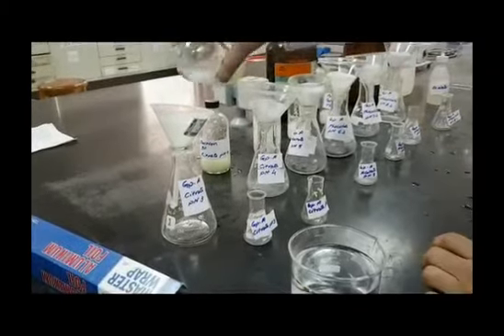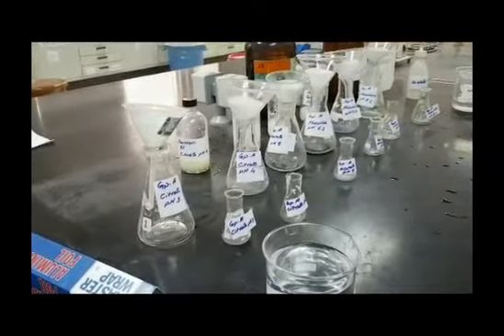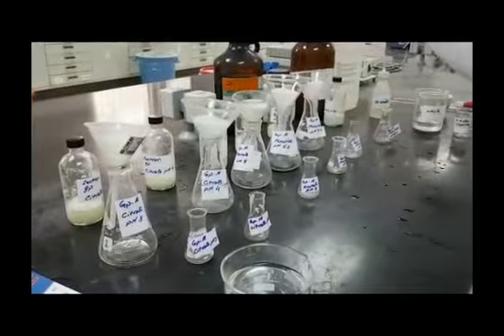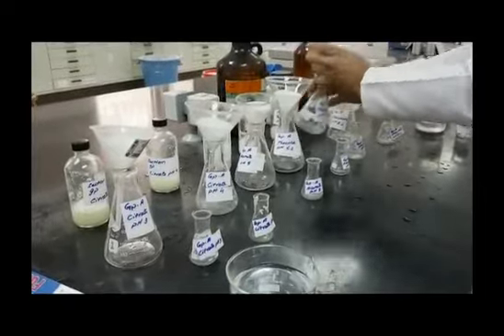Do the same in all experiments. Specifically this one, I cannot emphasize enough the importance of labeling.